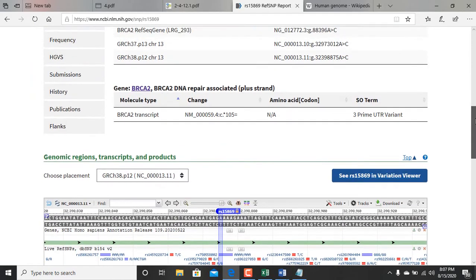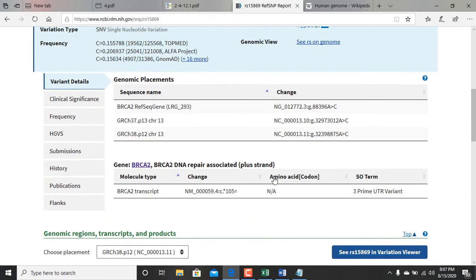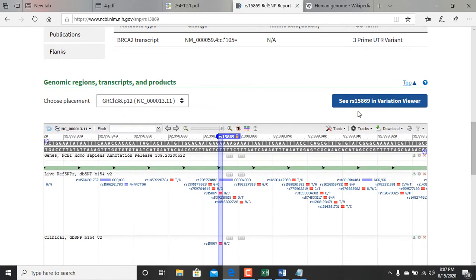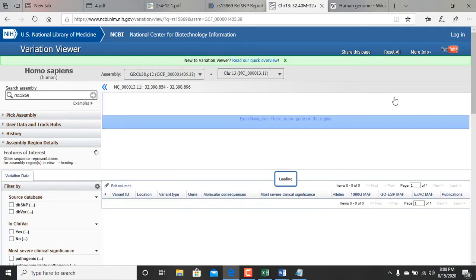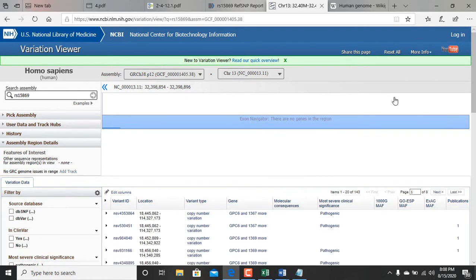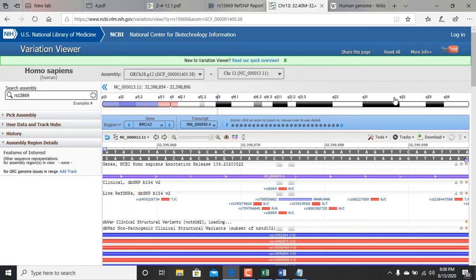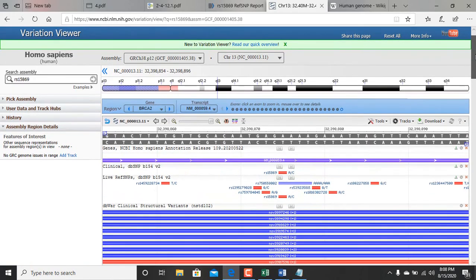I don't really know what all these things mean but I know what amino acid, there was no amino acid for this point, the molecular type. Let me check in variant view. This is what I got.